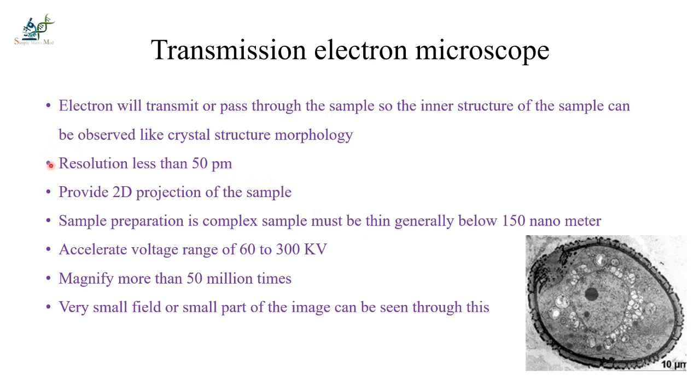And the resolution is less than 50 picometer. 1 nanometer is equal to 1000 picometer. So you can imagine how small 50 picometer is. And it provides a 2-dimensional projection of the sample.